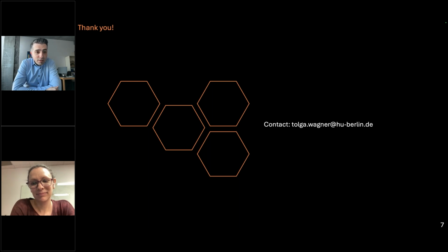But if you have devices which drive high currents, of course, you need to include your magnetic phase shift. And then you need to find ways where you can see differences and make calibration or other types of measurements to correct for them. I mean, in magnetic investigations, the sample is always flipped upside down to get rid of the electric part. Maybe we can do something similar here. Then, of course, we need a new chip, which is flippable. Always a discussion to be had, right?